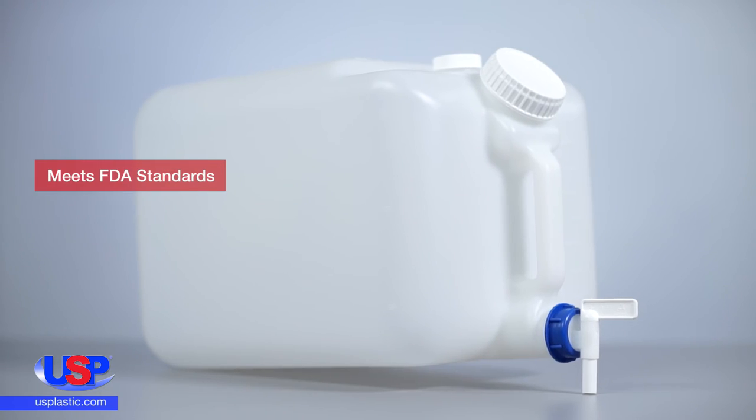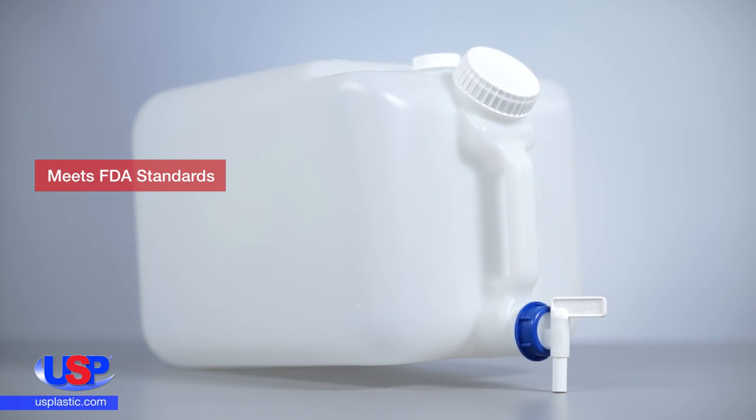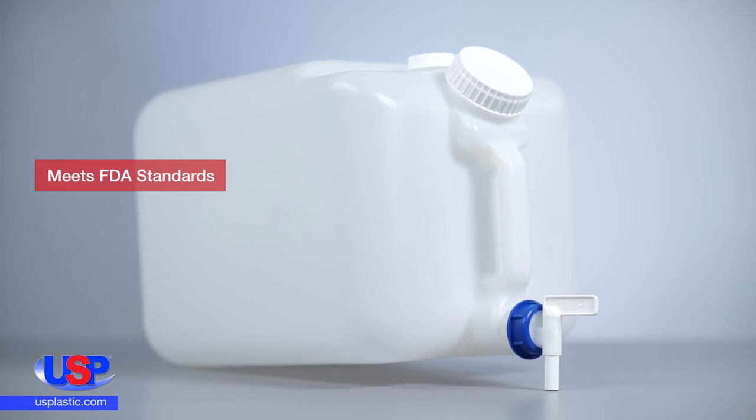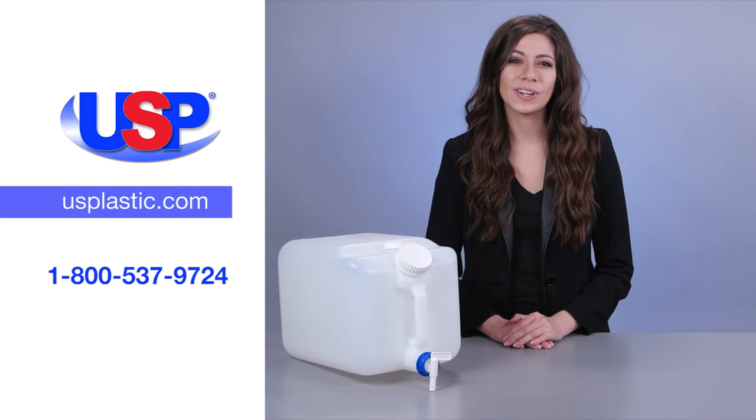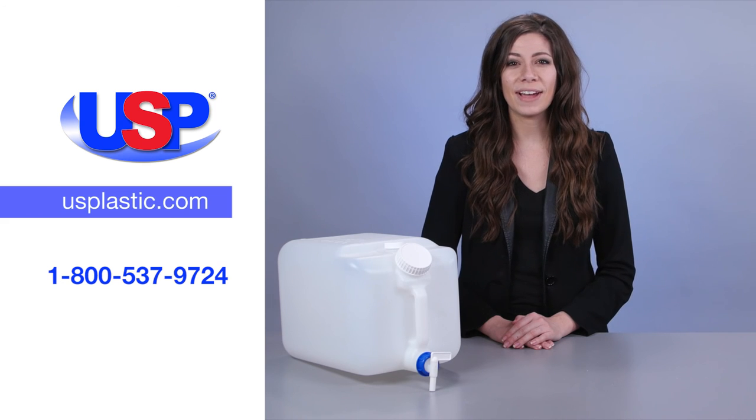This easy-fill carboy meets FDA standards for use with beverages, photo-related chemicals, drugs and many more liquid products. For more information on all of our quality carboys, visit us online at usplastic.com or call us at 1-800-537-9724.